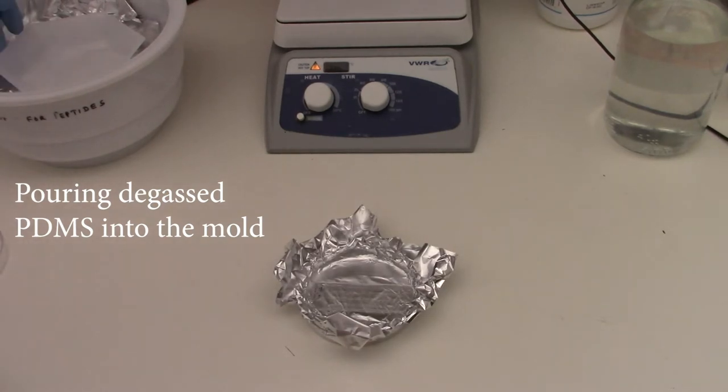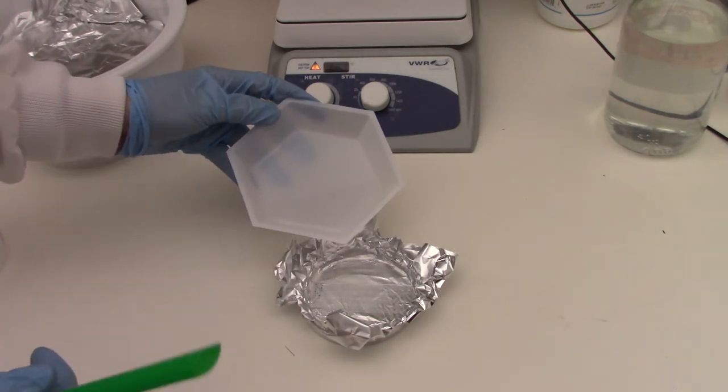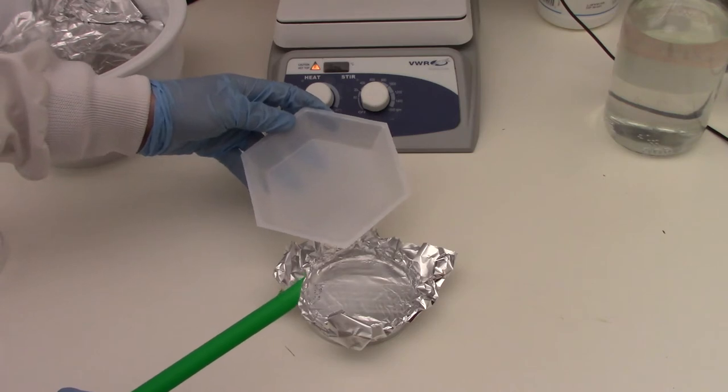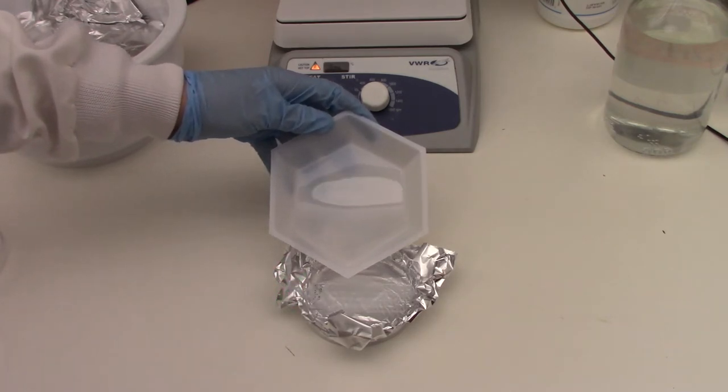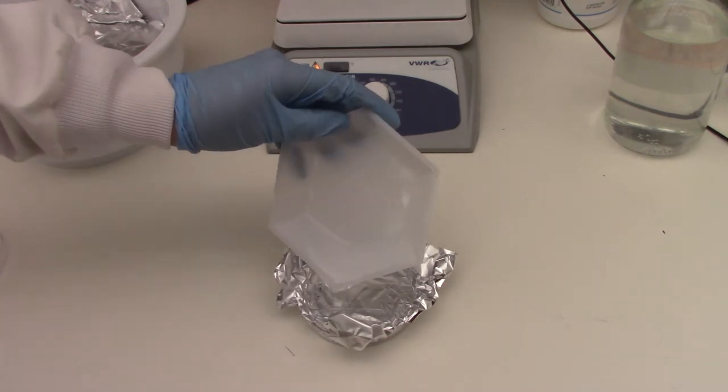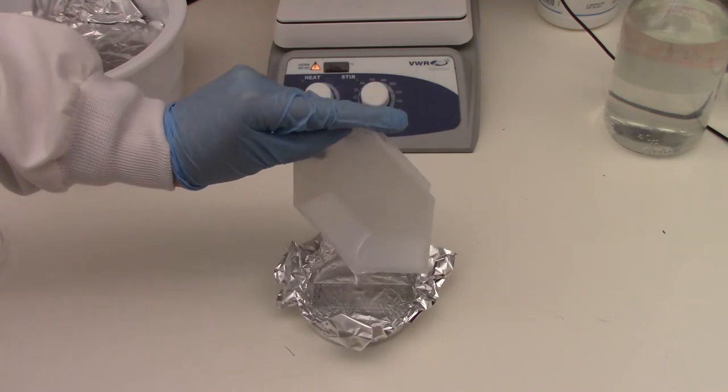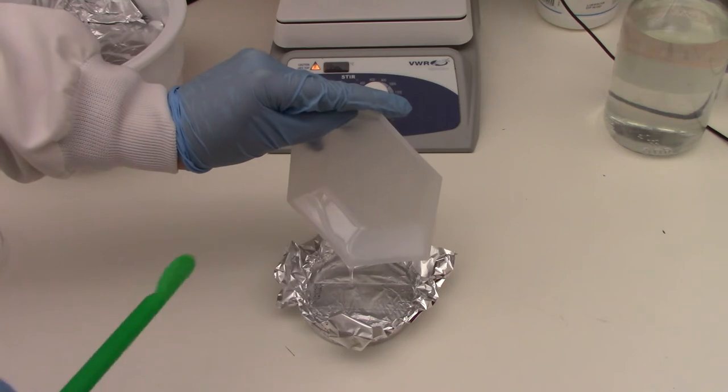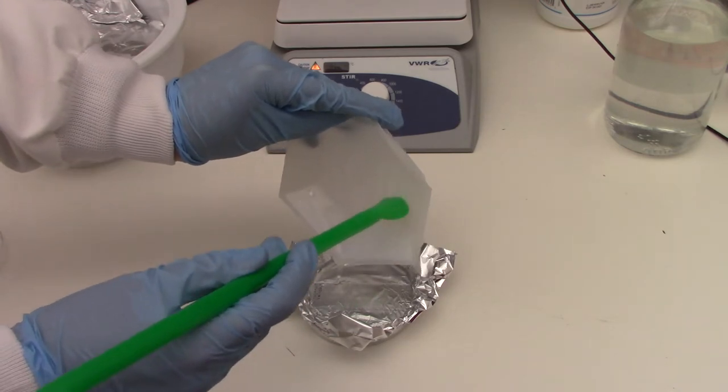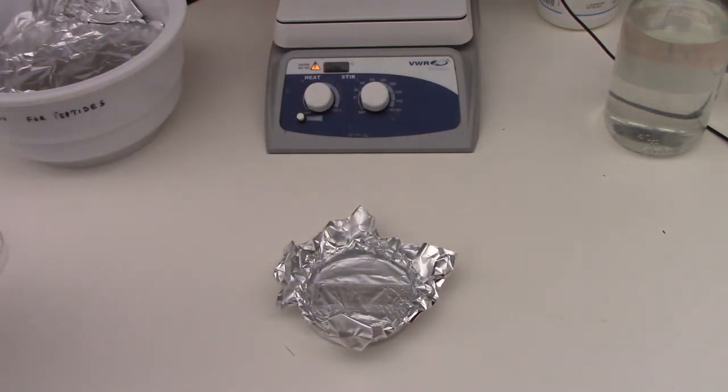So now that we degassed our PDMS, we'll take our boat and then our liquid boat and pour it into the features. Since we degassed it in a separate container from our master to try to avoid introducing air bubbles, we'll pour slowly and also close to the surface. And I like to just pour over the center of my master mold. Then as an added tip, if you want to get more of the PDMS out of your boat, you can actually take one of these spatulas and scoop it out, depending how thick you want your final PDMS device to be.